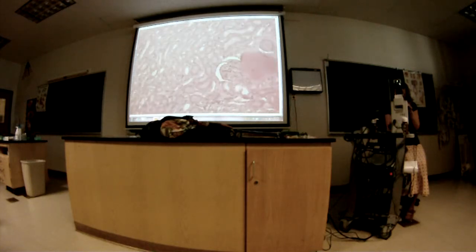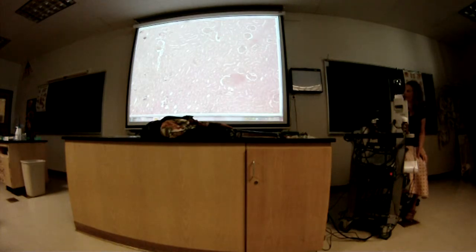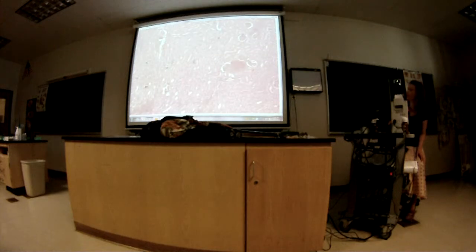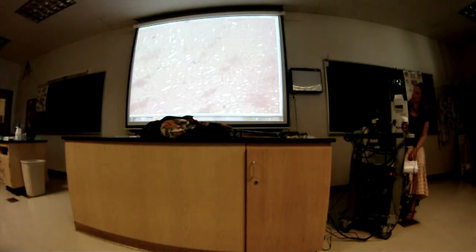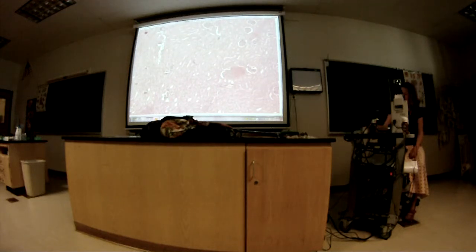On the slide, it's pretty apparent. On others, it's not as apparent. I saw one slide where it looked almost like you could draw a line through. This one, I'll get the injected one too. But so we're pretty close in there. So between that and that, it looks like the change is right about in here.